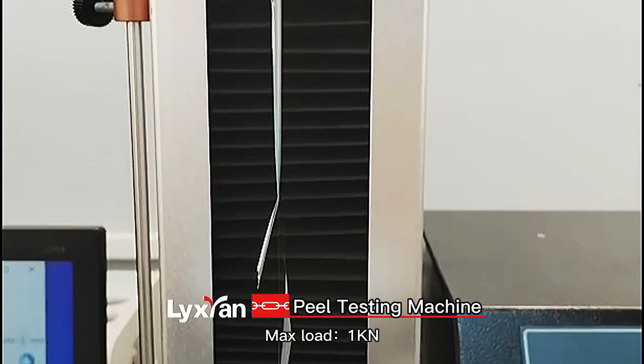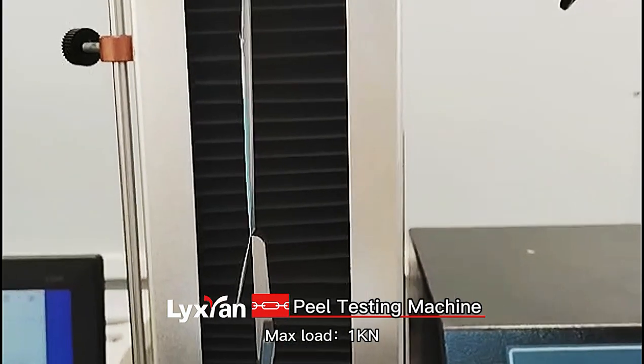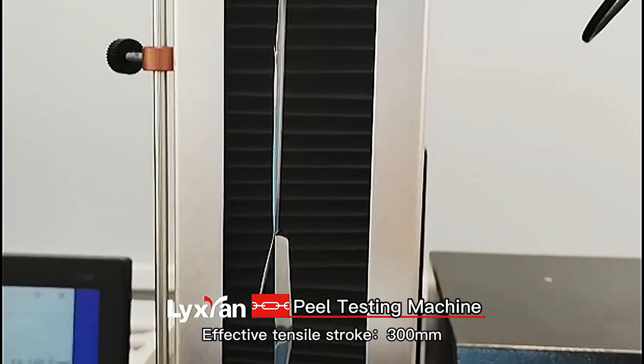Max load: 1KN. Effective tensile stroke: 300mm.